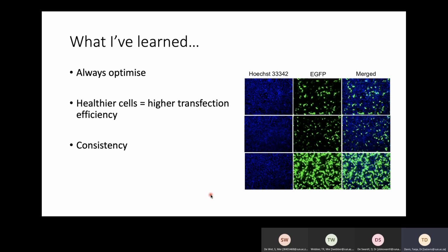Say, for instance, you want to transfect your cells with a sequence for overexpression of a protein of interest. If you had to transfect your cells, get the protein, and do a Western blot every single time, it's going to take a lot of your time.